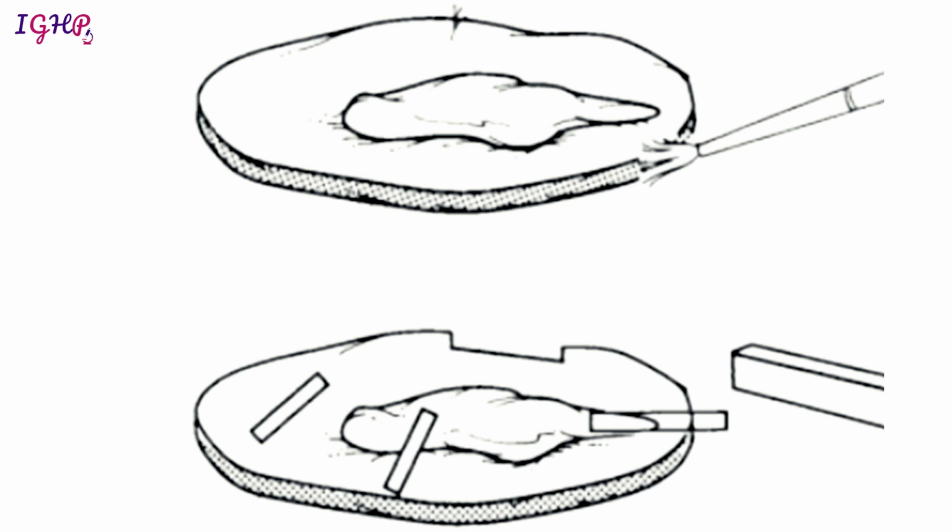So it depends. Suppose the lesion had been in a vertical fashion, then we would have liked to cut it in serial vertical slices, like this.